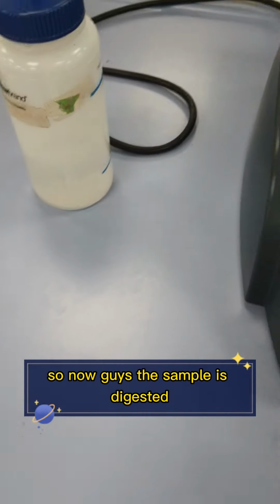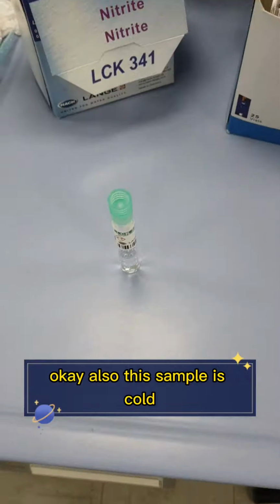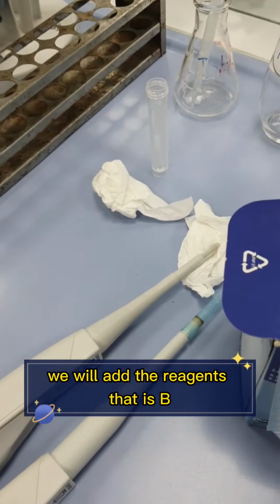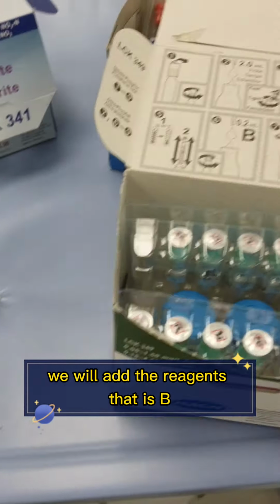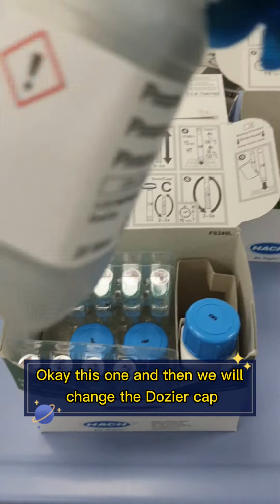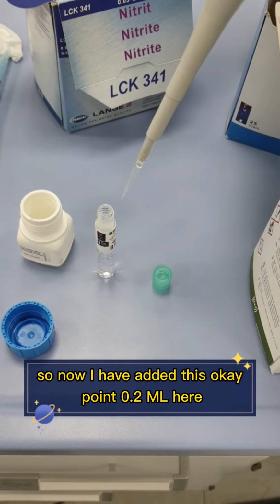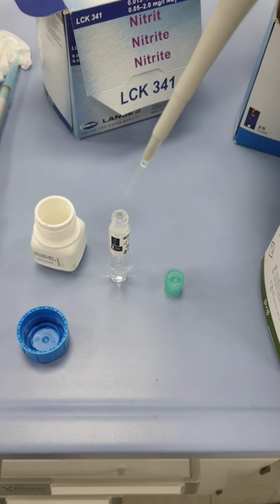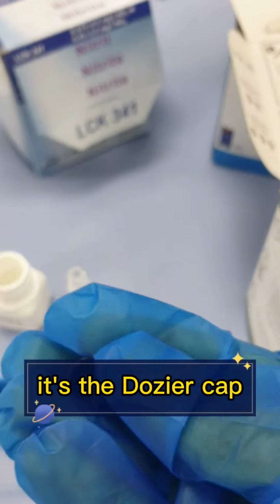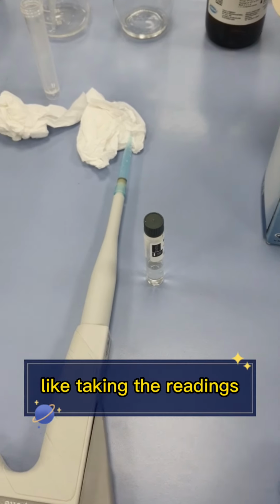So now guys, the sample is digested. I have taken out the phosphate samples. Also this sample is cold. So now what we will do, we will add the reagents, that is B, this one, and then we will change the dossier cap. So now I have added 0.2 ml here. Also now I'm going to change the cap. It's the dossier cap. We'll wait for around 10 minutes for taking the readings.